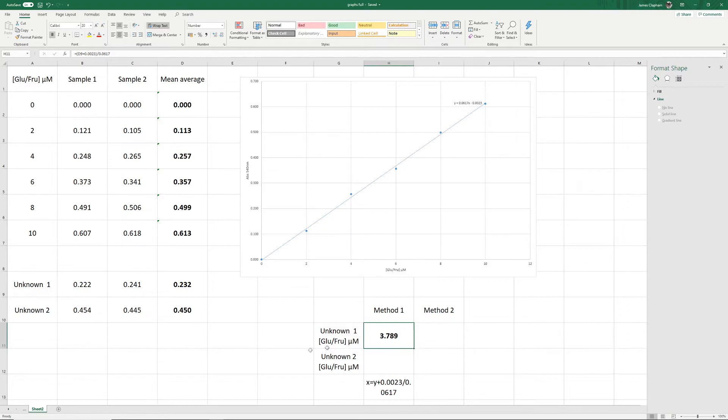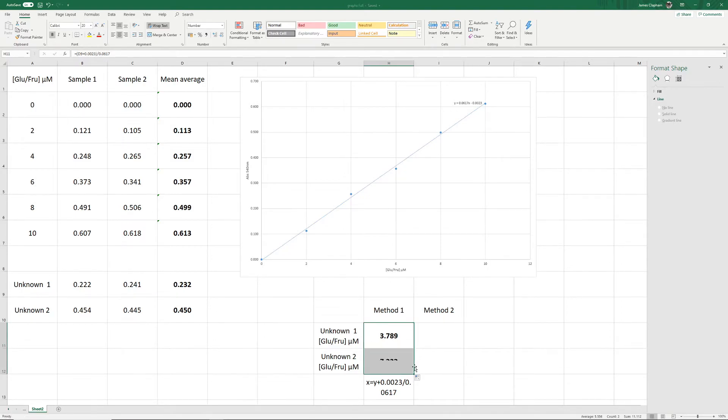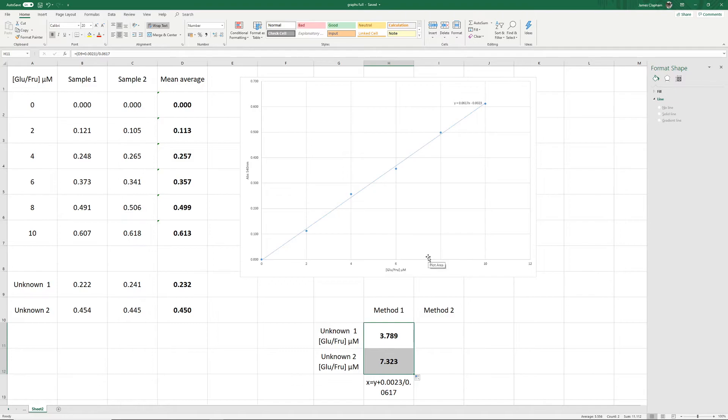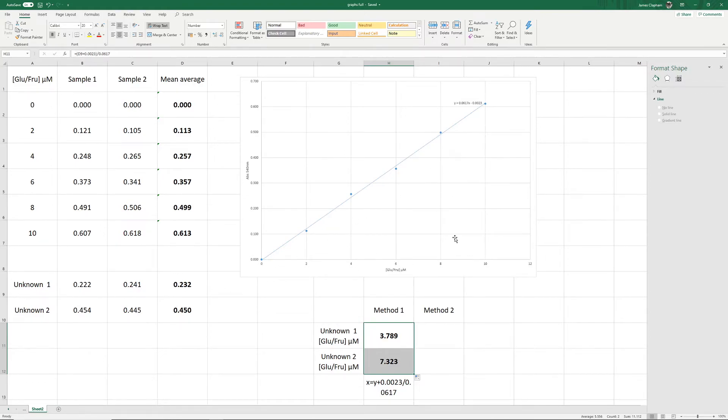Now, if we want to apply this formula to our other unknown, all we need to do is click on this little square on the bottom right of the cell here and drag it down. That will apply the same formula, but to this value here. So again, just to check this, 0.450, we go up and along and down. Yeah, I would say that's about 7.32. So that's one method of finding out your unknown values using a standard curve in Excel.